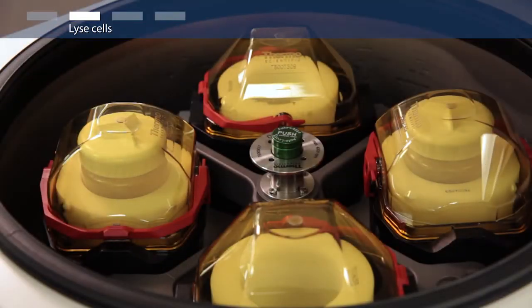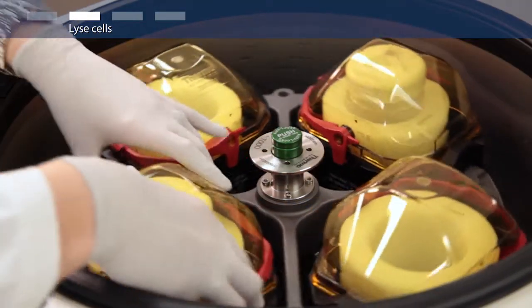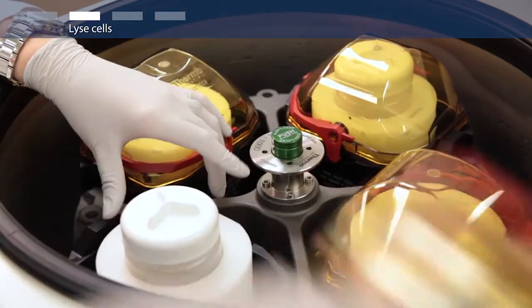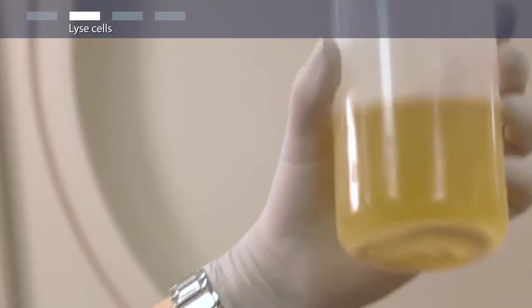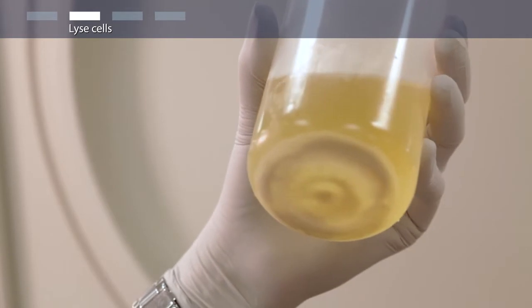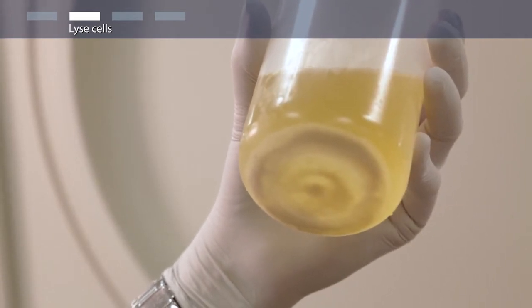To lyse cells from your overnight culture, first harvest the cells by centrifugation at 4,000 times G for 15 minutes at 4 degrees Celsius. Carefully discard the supernatant.